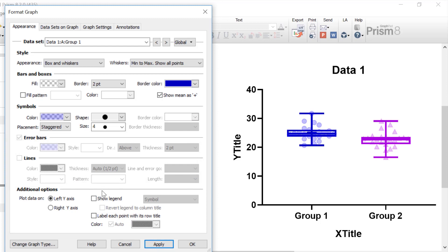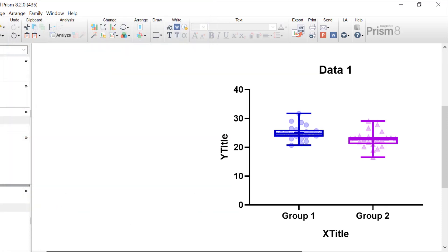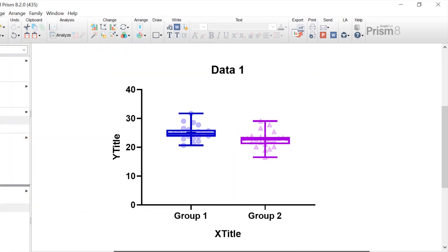And then finally, in the additional options below, you can choose to have a right y-axis on the graph as well as the left y-axis. You can choose to show a figure legend. In this example, it doesn't make sense to have a figure legend shown, since the group names are shown underneath each box and whisker plot. However, if you have multiple groups within your plot, you may wish to show a figure legend. So I'm currently happy with this graph, and I'm going to click the OK button to return back to the graph.